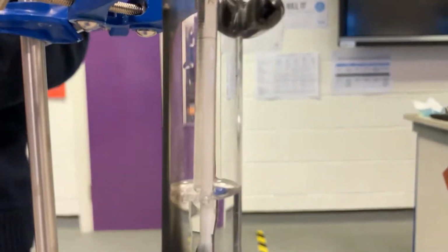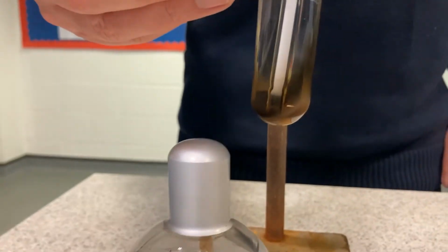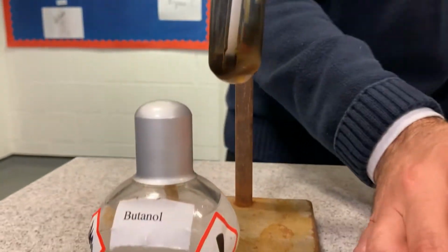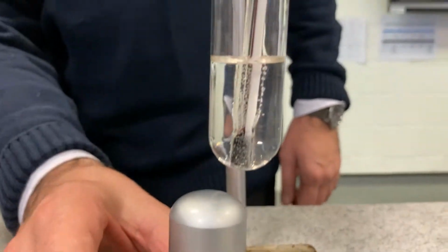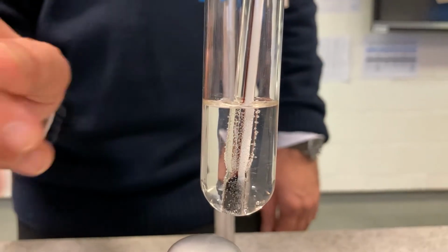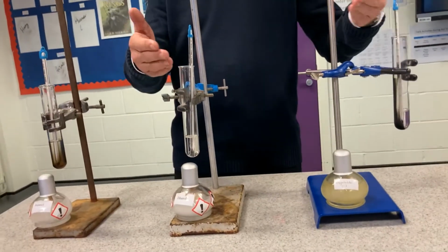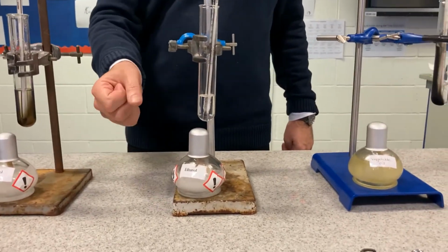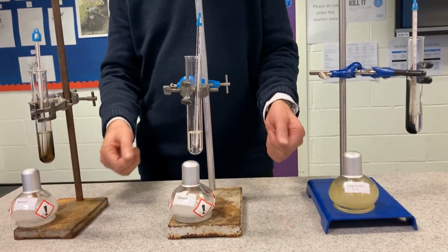This one here, the butanol, appears to be the best. It got the hottest. On the other hand, it does make a bit of black smoke, so that's not perfect. This one's the cleanest. If you're burning this in your house, this would be the nicest and cleanest. It would be the least horrible, but it doesn't have quite as much energy as butanol. Anyway, that's the experiment. We heated them up. We made it a fair test by having the same amount of water and the same distance, starting at the same temperature, and we burned them all for the same time, and that's what we got.